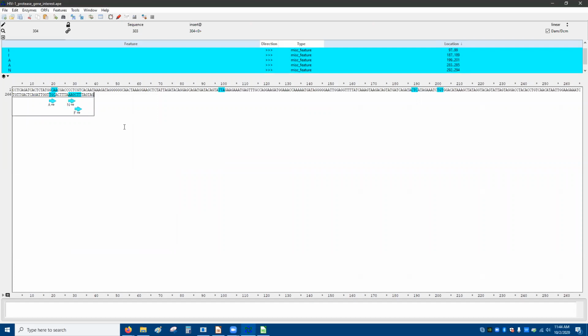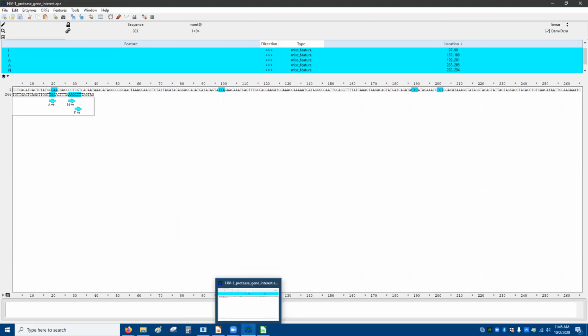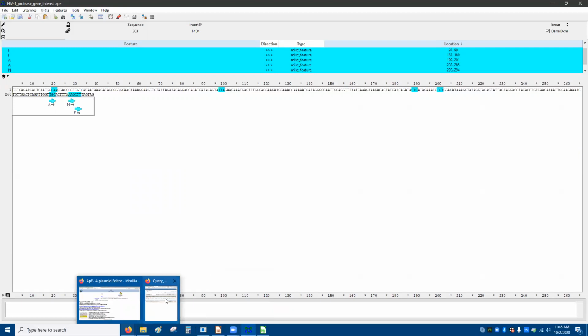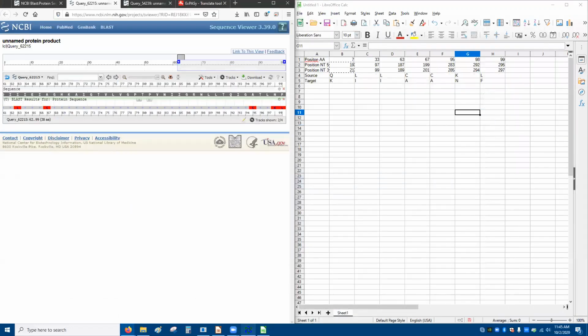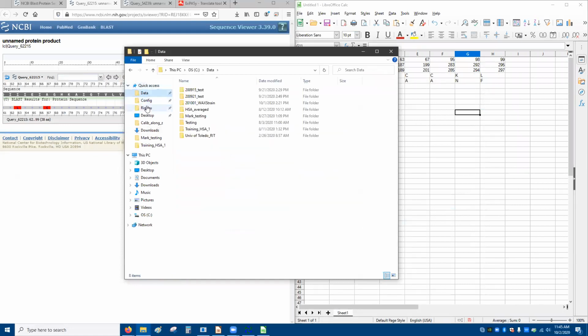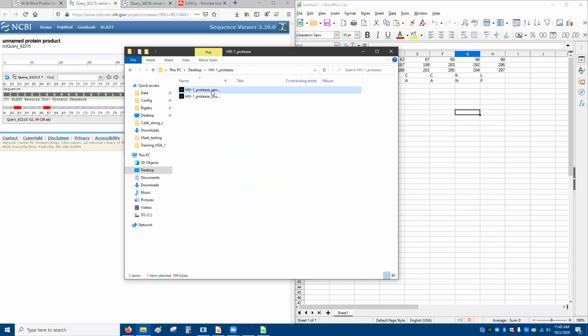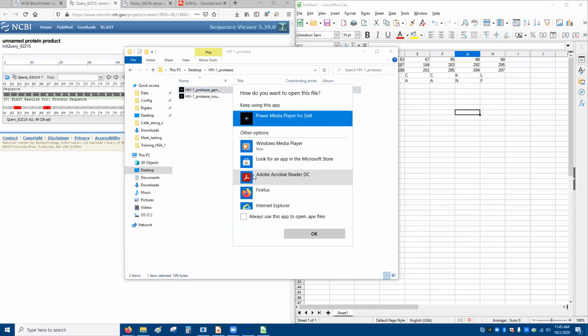Okay, so next thing to do is we probably want a cutting site here. So let's look at the source DNA. Oh, I don't have it up. Go to blind. Oh, I don't use that.